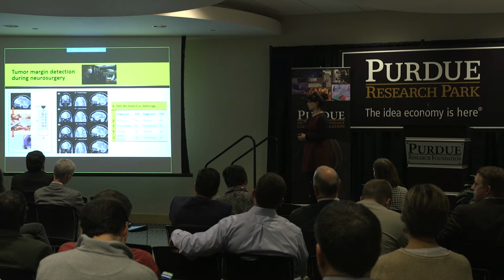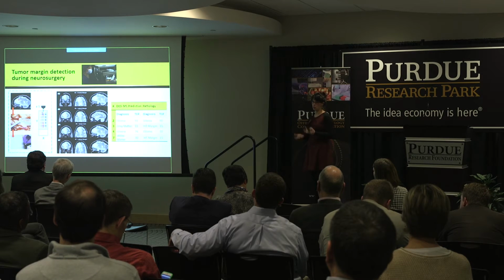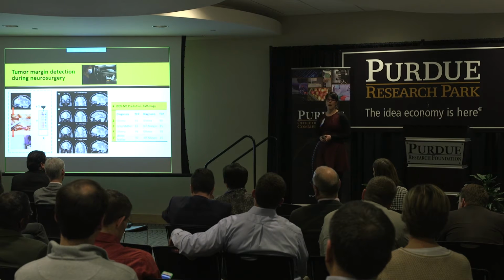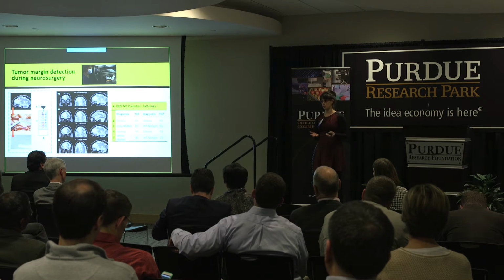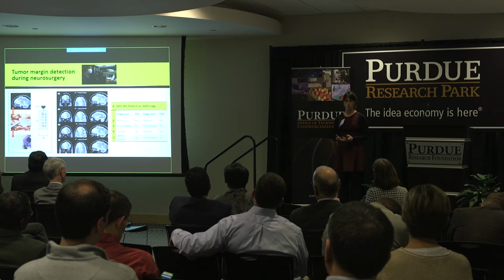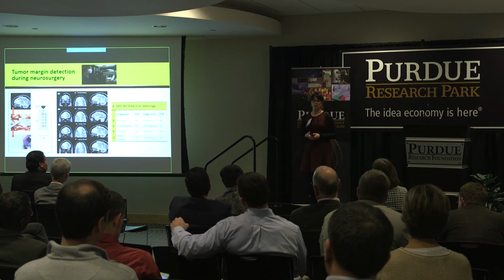One of the applications we are trying to put out there in the clinical settings is the use of DESI for tumor margin detection during neurosurgery. So gliomas are tumors that grow within the brain, and they tend to infiltrate into the surrounding tissue, essentially making tumor margins nonexistent. And this poses a big challenge for the neurosurgeon to actually cut the tumor during surgery and remove as much as possible. The technology available is not really helping the surgeon to cut the tumor, especially the surgical margins.